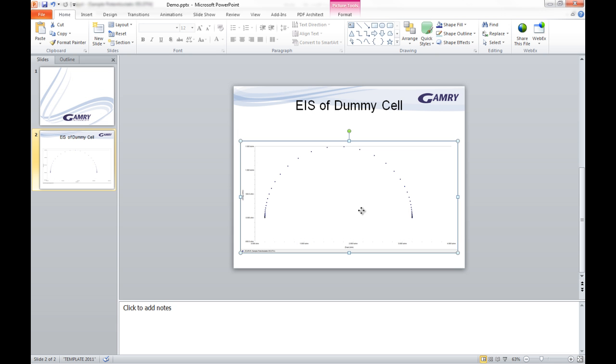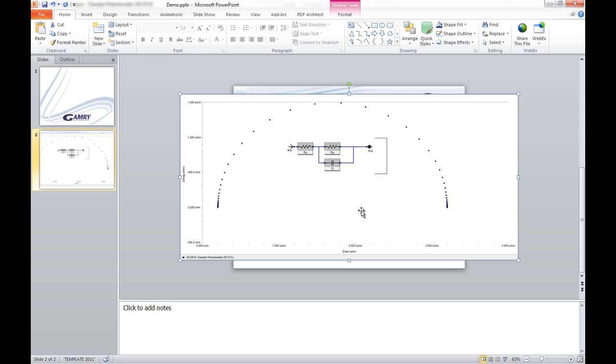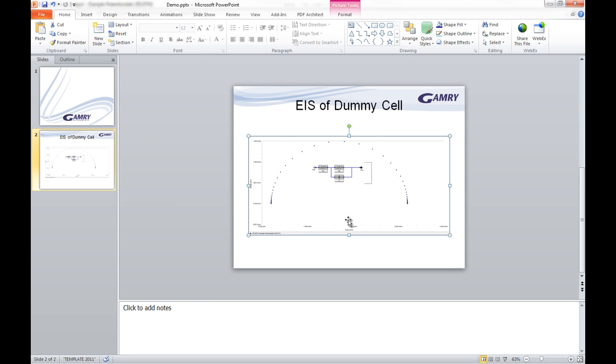Go back over to PowerPoint. Then I'm going to paste it in. And that is how you export GAMRI EIS data from eChem Analyst.